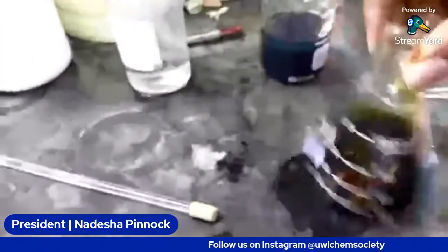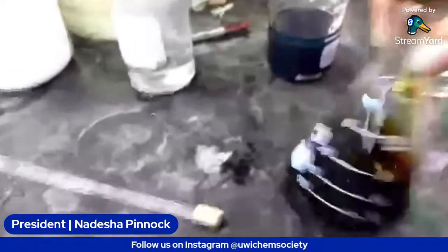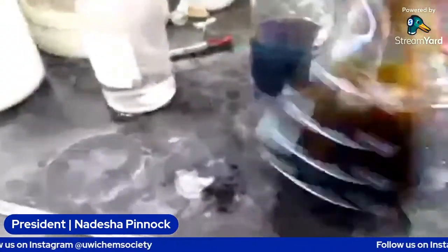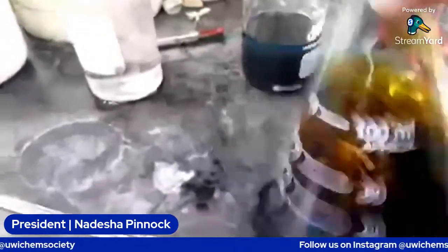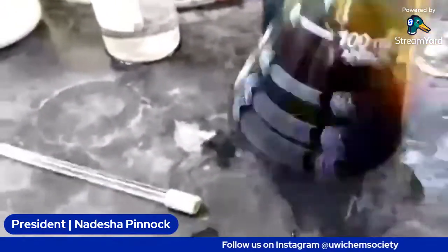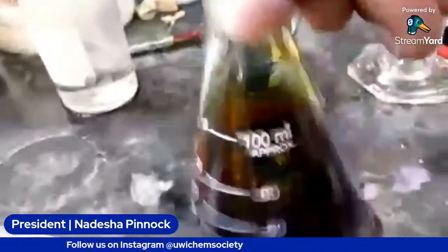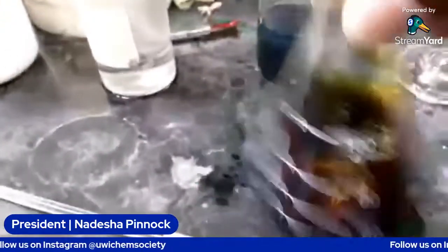So we're going to mix this. So this pretty much looks like iodine, right? So this is the Lugol's reagent. We're going to add it to our food samples to determine if we have starch present.